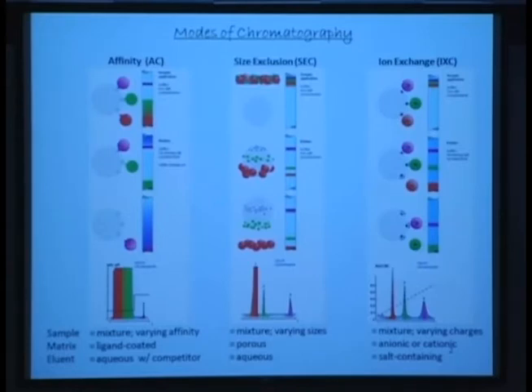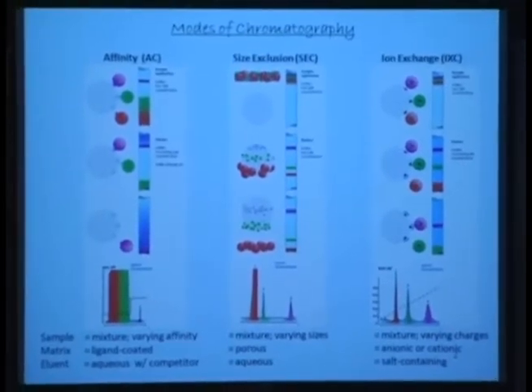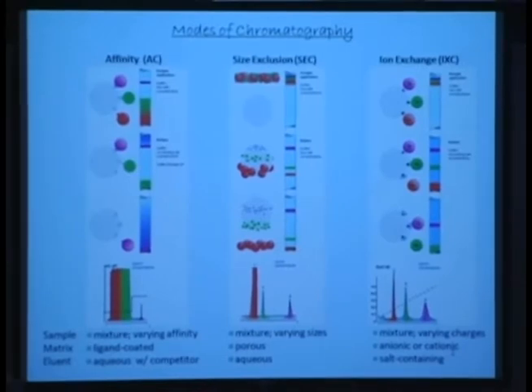So smaller molecules typically are retained more than the larger molecules, and eventually what typically happens is that in the first few fractions you would see much larger molecules, followed by smaller molecules, followed by even smaller molecules. So this is exactly opposite of what conventional thinking is. Conventional thinking would be that for small molecules, the number of interactions, the number of OH groups, the number of things that could actually interact are less, and therefore would not be retained as much.